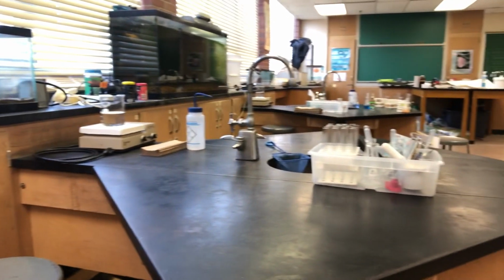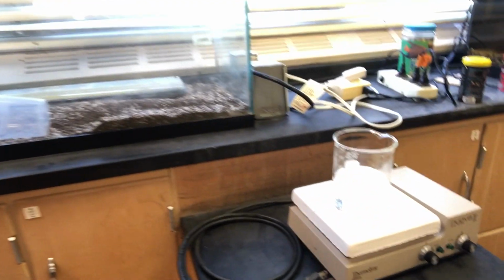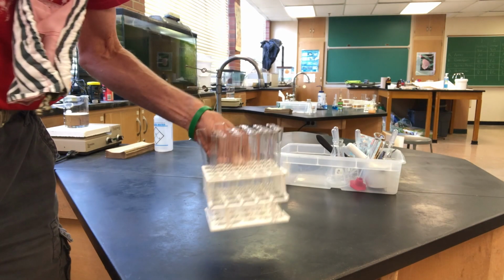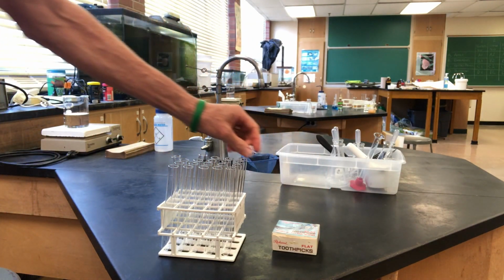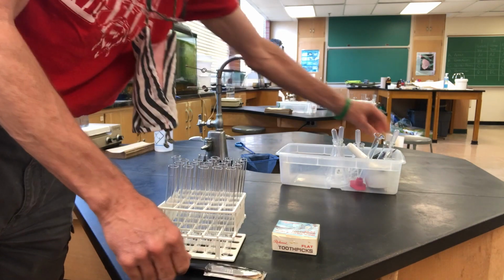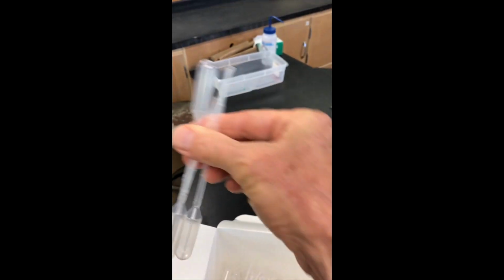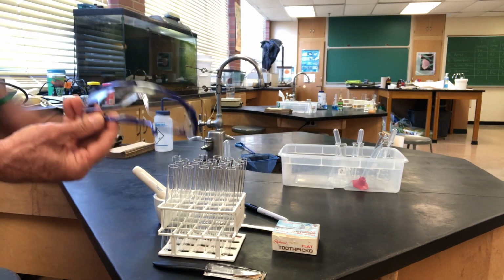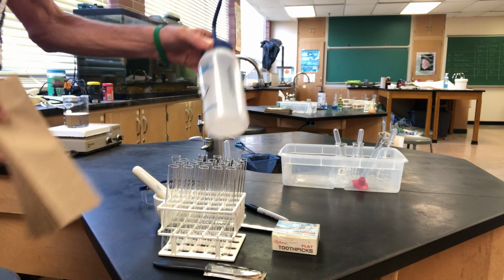The materials you will need for this lab include a few pieces of equipment and glassware, the reagents, and the samples. The equipment includes a hot plate and a beaker of water with some boiling chips, test tube tongs, a test tube rack with tubes, toothpicks, a paring knife, a spatula, a pestle and mortar, 1 milliliter and 3 milliliter disposable transfer pipettes, a permanent marker, safety goggles, a squirt bottle of deionized water, and paper towels.